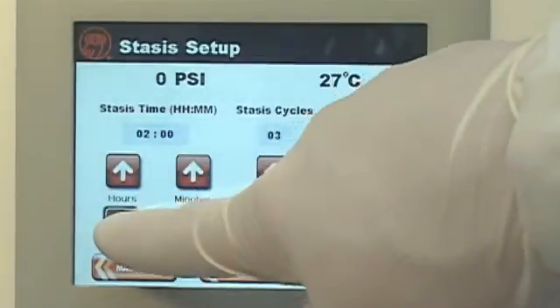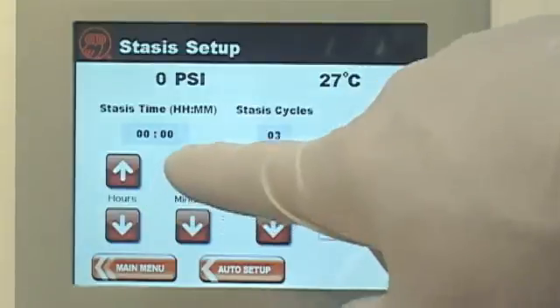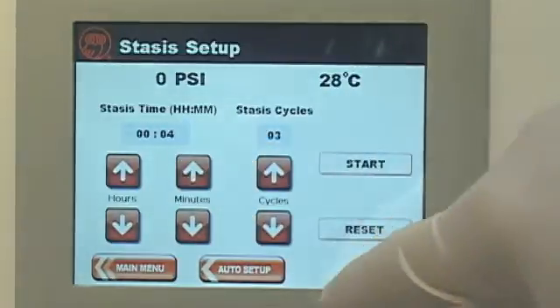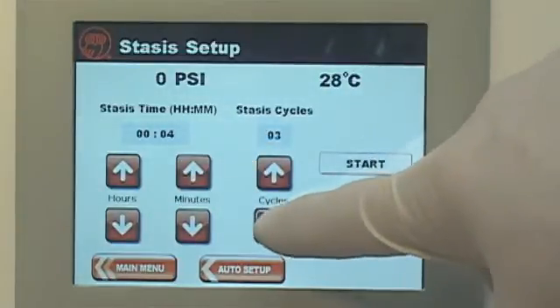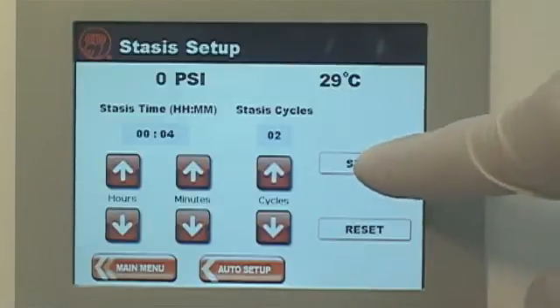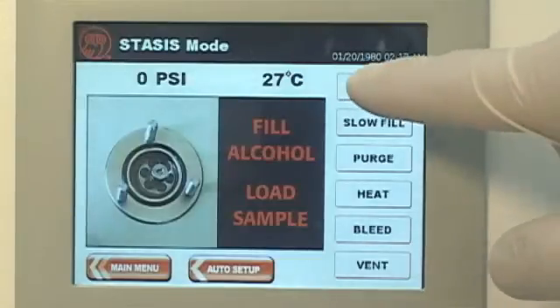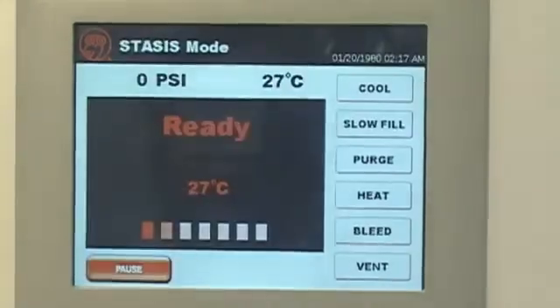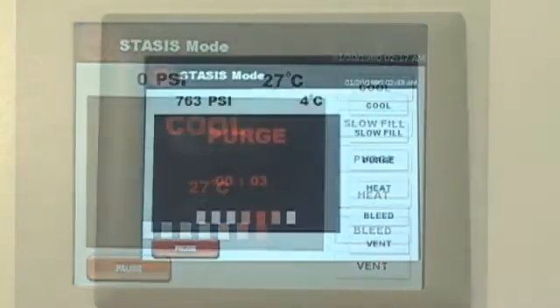At this point, the time in stasis can be selected, followed by the amount of times to cycle through the stasis mode. Now, the fully automatic process can be initiated. The system will cool, fill, and enter purge. Then enter the stasis phase.